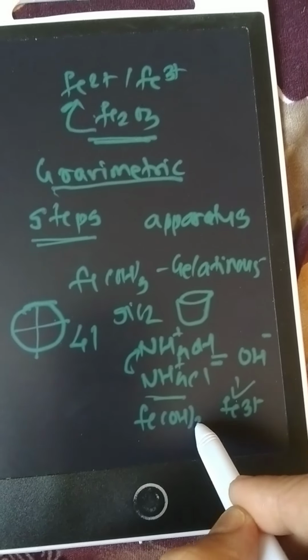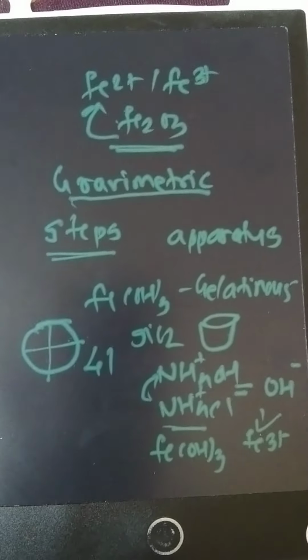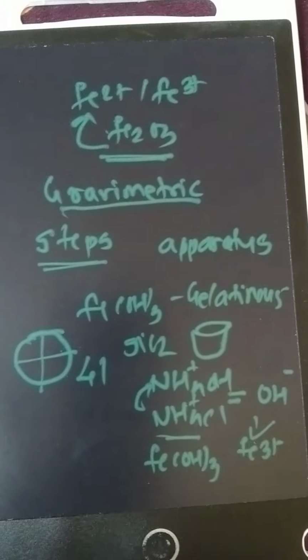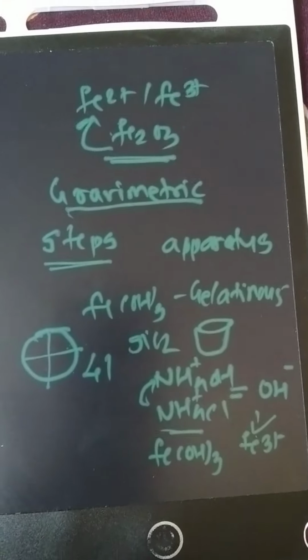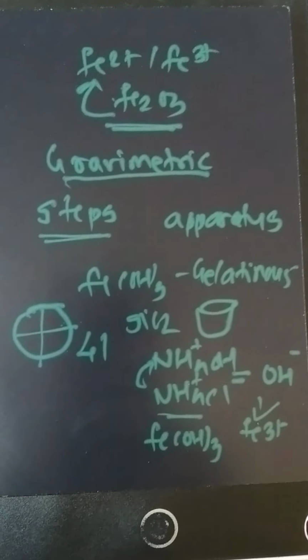So that type of theoretical questions will be asked on this experiment. This is a very important experiment for gravimetric estimation of metals. So this type of virtual labs we have to study for a variety of experiments.